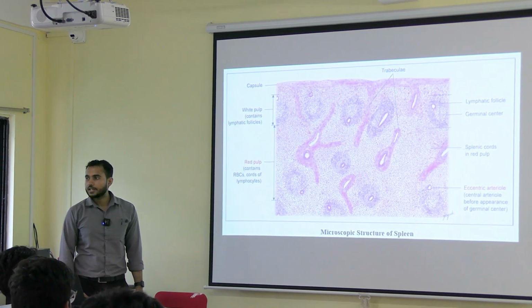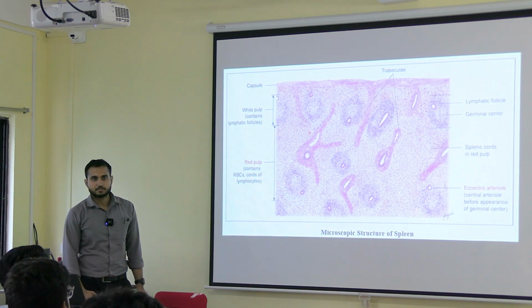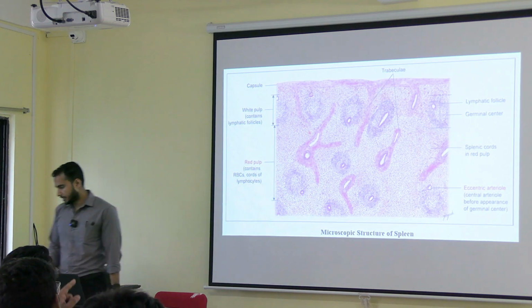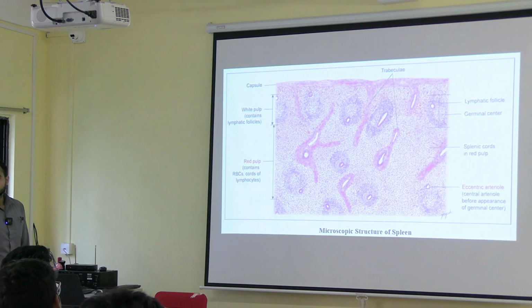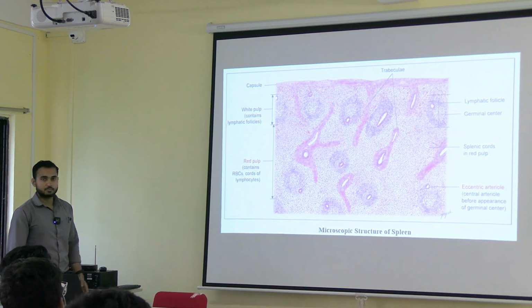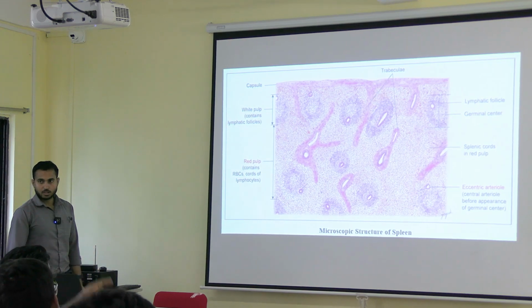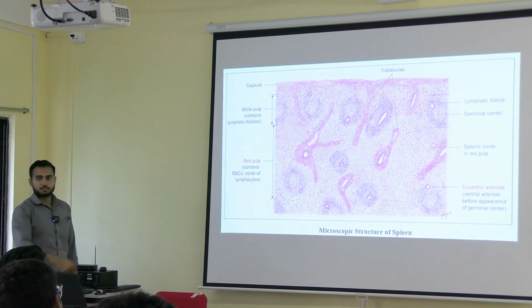Next, what you have to identify in the spleen? Red pulp and white pulp. Can you identify where is white pulp? Anyone please come and show me where is the white pulp? Yes, these are the white pulp. This is one white pulp. This is white pulp. This is white pulp. This is white pulp. All these are white pulps.